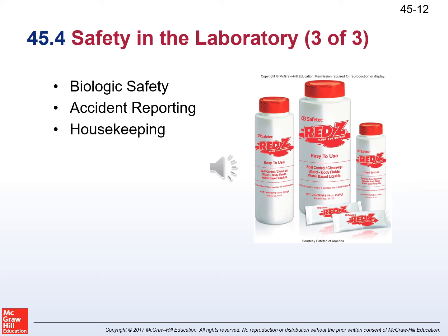Every specimen should be treated as if it were contaminated. Mouth pipetting is prohibited at all times. A pipette has a bulb on top. When you squeeze it, the liquid is drawn up into the cylinder, similar to a turkey baster. Mouth pipetting is more like a drinking straw. Please do not mouth pipette your samples.